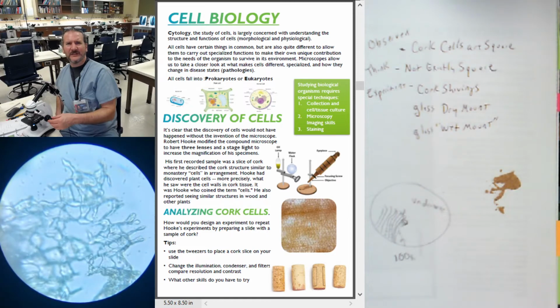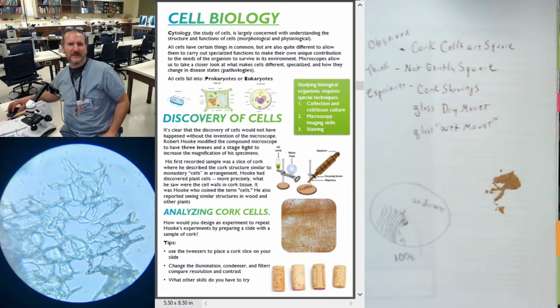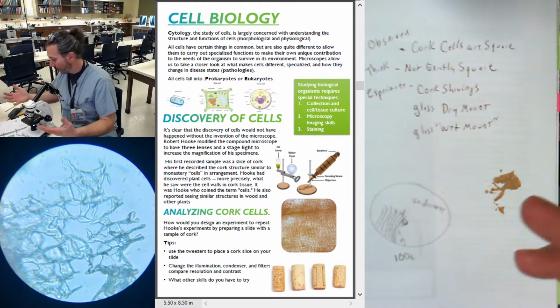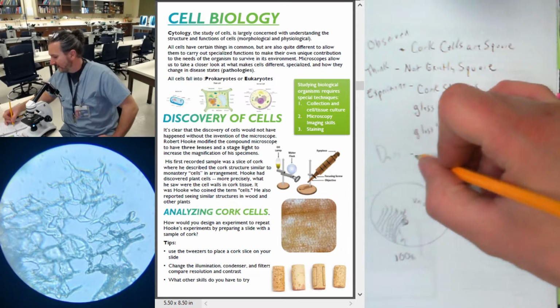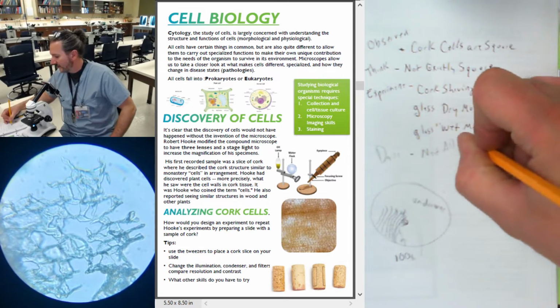Okay, that's pretty cool. So I can see a couple intact cells. Here's a decent cell. There's a decent cell. So it looks like they were probably at one time squares, but no, not so perfect. Snapping a picture. Nice. Alright, so what do we find out? And I snap pictures because I want to keep moving on with this. Not all look square.